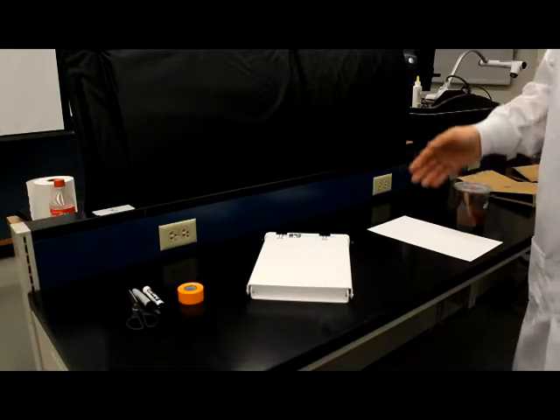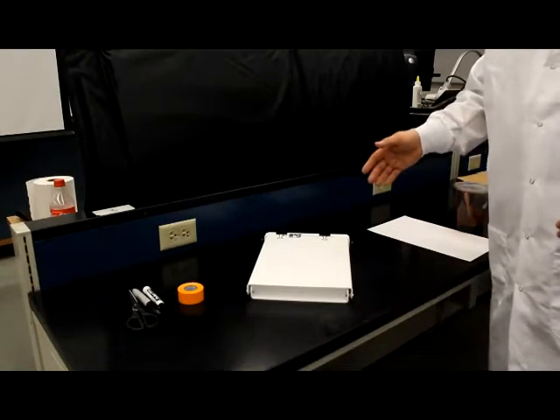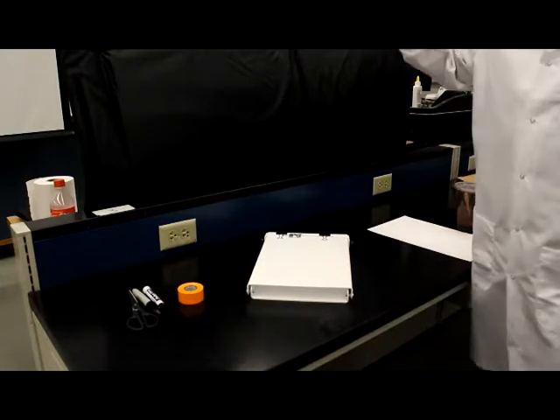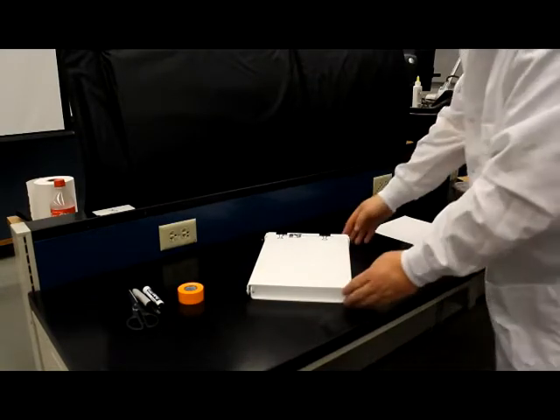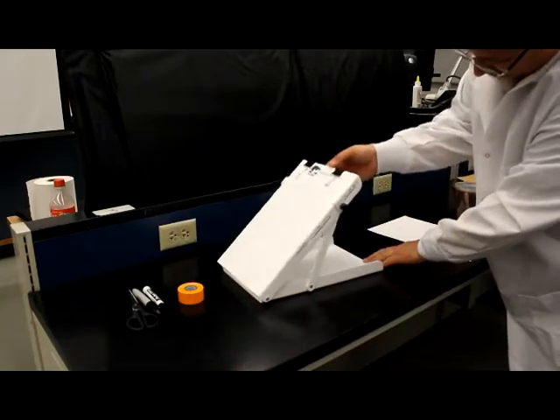Today we're going to overview exactly how to use the blood spatter apparatus for setting up your blood spatter. This is going to allow you to make different angles of impact, and it's going to do that because you can actually set it up at different angles.